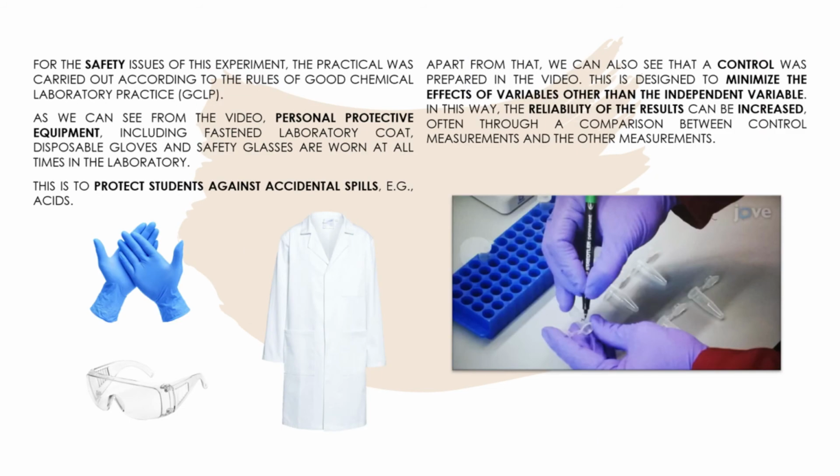For the safety issues of this experiment, the practical was carried out according to the rules of good chemical laboratory practice. As we can see from the video, personal protective equipment including a fastened laboratory coat, disposable gloves, and safety glasses are worn at all times in the laboratory. This is to protect students against accidental spills, for example, acid spills.